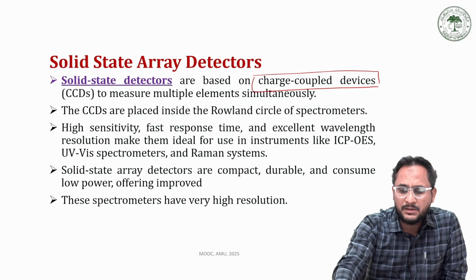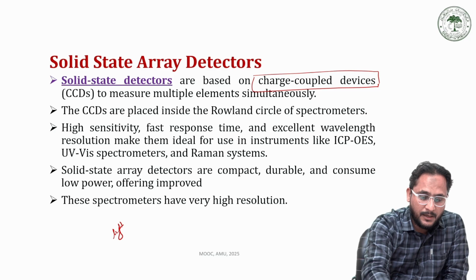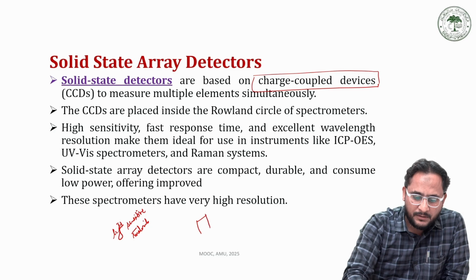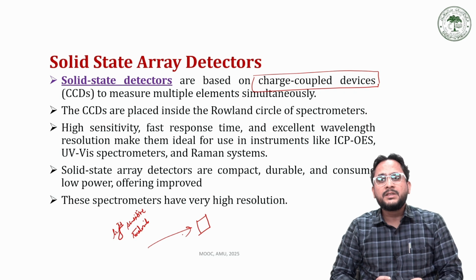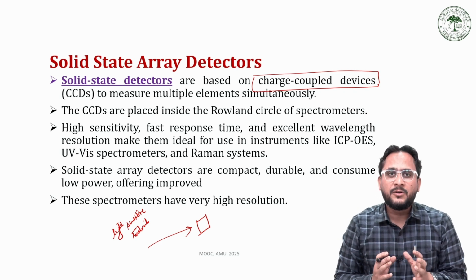Now these charge coupled devices are basically light sensitive materials, or you can say sensors, that work on the principle of the photoelectric effect. For example, a small single light sensitive element is like this. When light falls on it, it captures light photons, and they work on the concept of the photoelectric effect.